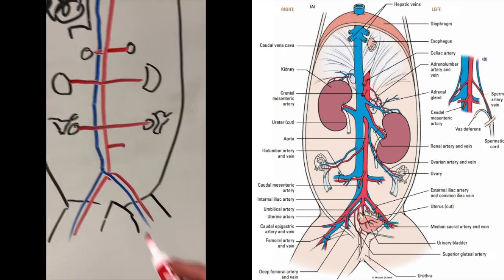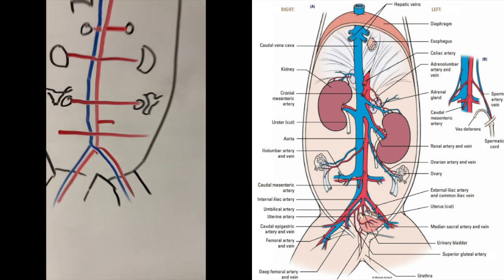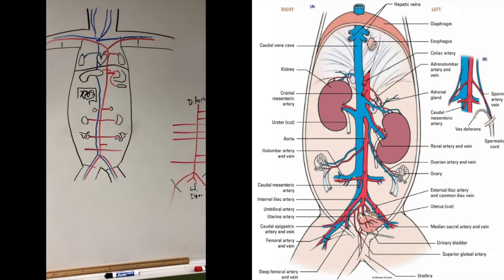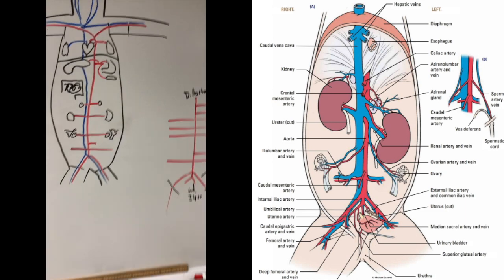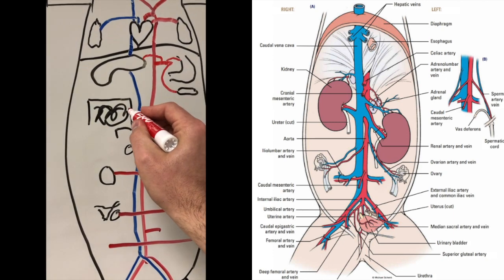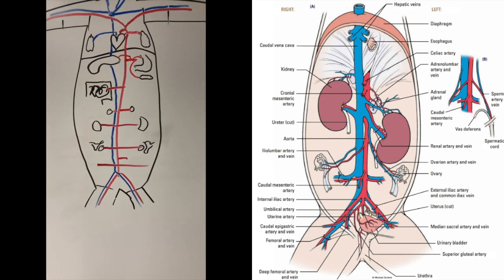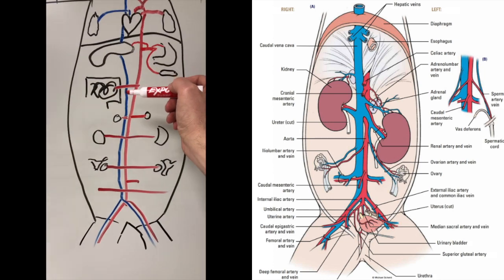And then down here, we should have the iliolumbar, left and right. And so you can see that we basically just applied, oh, sorry, forgot our superior mesenterics right here. So our superior mesenteric essentially feeds that colon and the small intestine right there. So we've got our first two unmatched, our celiac trunk, our superior mesenterics.